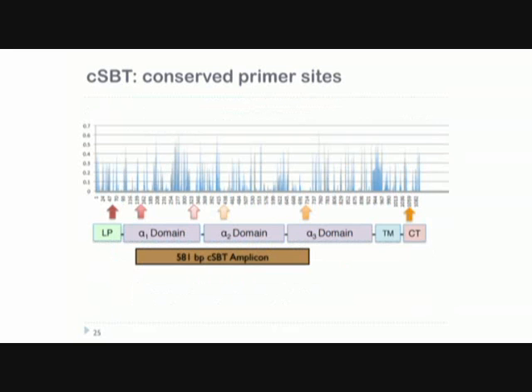When we first started, we generated a 581 base pair amplicon that spans from this arrow to this arrow. And as you can see, there's an enormous amount of diversity in the amplicon that we're able to generate. To test the performance of this amplicon, we contacted the International Histocompatibility Working Group, and we got a set of about 40 HLA lines that are their reference cell lines that they use to validate all new technologies.